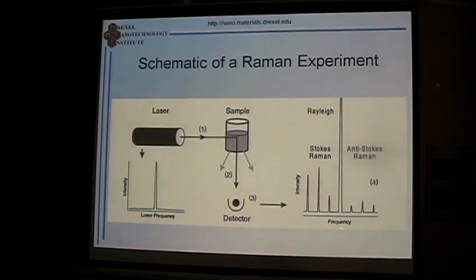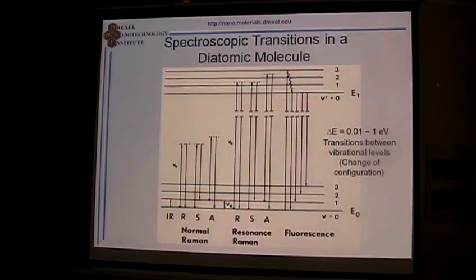What you collect is a spectrum that contains, of course, Rayleigh scattering, plus some much weaker peaks, which are shifted in wavelength from the Rayleigh line, which are called anti-Stokes or Stokes lines, and we will talk about their origin later. So, where does the Raman effect come from?